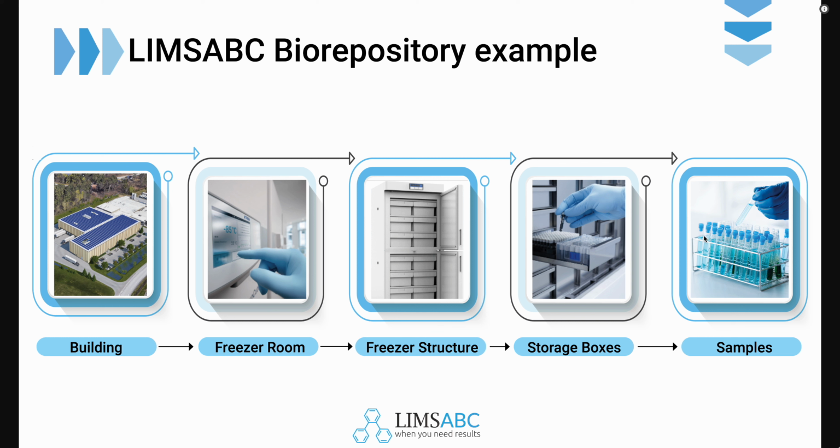It allows you to track which racks those container tubes go in. We call them storage boxes, and then you can track where those storage boxes go in the different locations that you have, being freezers, going into the different freezer rooms, the buildings, and so on.